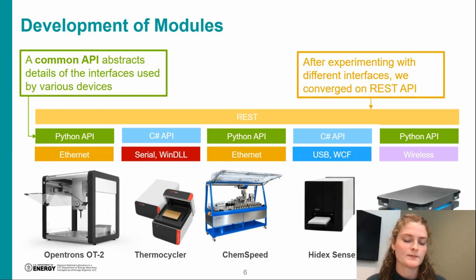But the problem with the driver is that the driver is meant to speak that Ethernet or serial language, and the driver is not necessarily standardized between instruments. Also, in order to make it easier, if the company provides one, we tend to use that first, just to prevent duplicating effort. So what we do to standardize it is, on top of that, we put a client layer. We've been experimenting with different client layers, but we've converged on using REST API because it's pretty simple and it's applicable to all of our instruments.